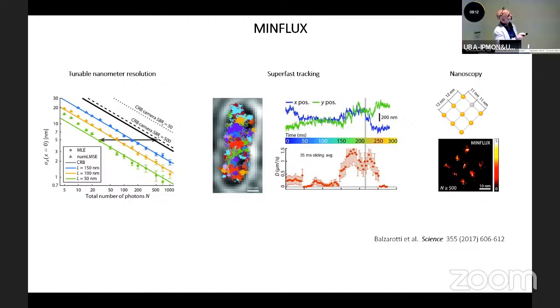Here for imaging, we had to test it. And how to test this? Well, we used DNA origami again. So we prepared the DNA origami, and we put 6 fluorophores, or 8 fluorophores at distances of about 10 nanometers, and we image them. We let them blink, and we image one by one, and this is what we obtain. And you see, we can really image very small structures. The scale bar here is 10 nanometers.